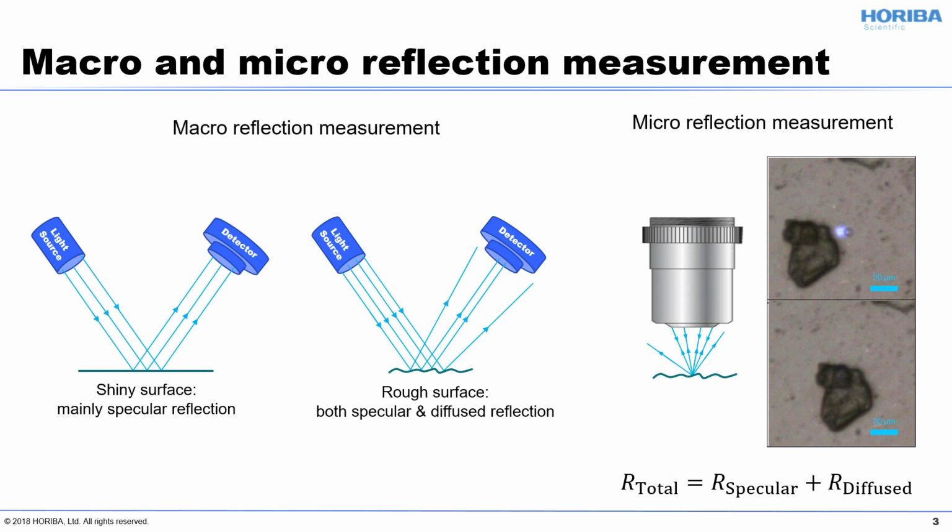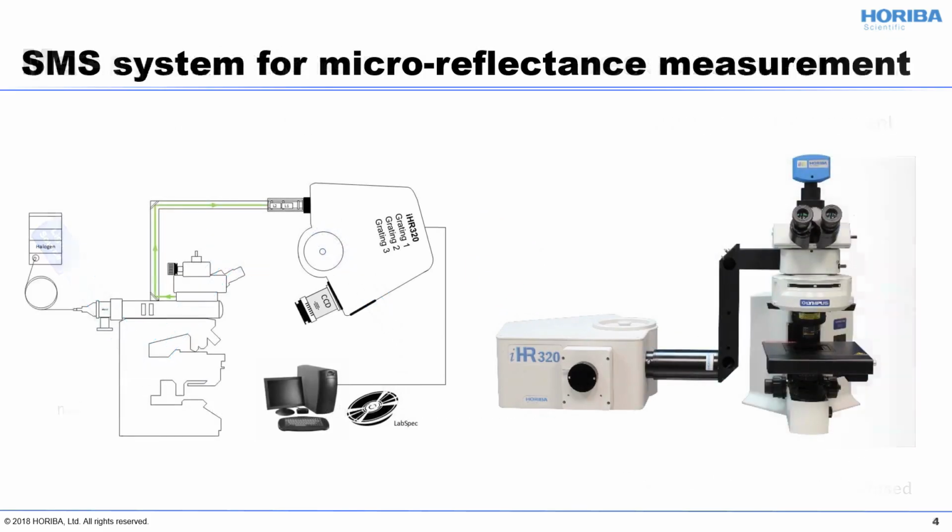The numerical aperture of the objective plays a very important role on the scattering surface, because the divergence angle determines the range of angles that can be collected. So we expected that a larger numerical aperture can collect more diffuse reflection from the scattering sample surface.